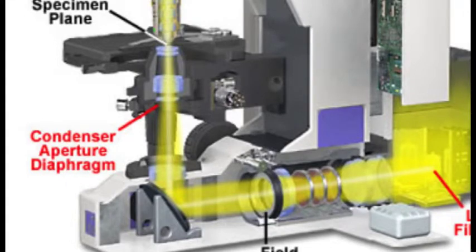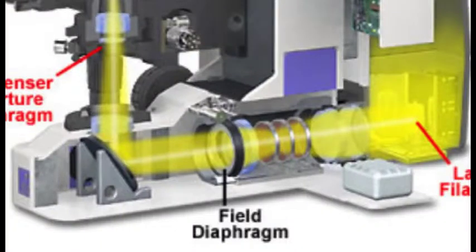We want to align our optical system so that we have no specular reflection or internal reflections in the microscope. And in order to do that, we have to close down the field diaphragm so that we see it in the field of view.